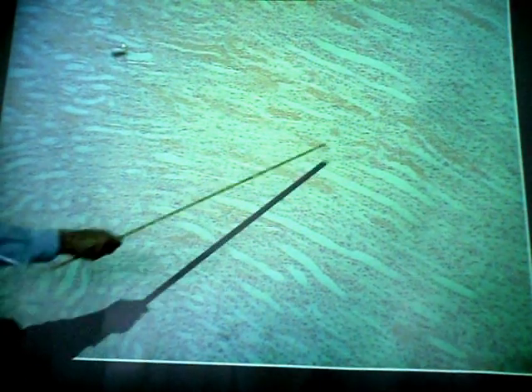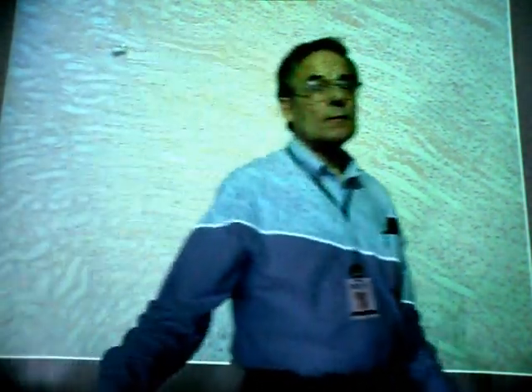Again, I'm not going to actually distinguish these, so you know what kind of tubes they are. I won't ask on the slide which one is this or that. Any questions on the kidney? It's really not that bad.